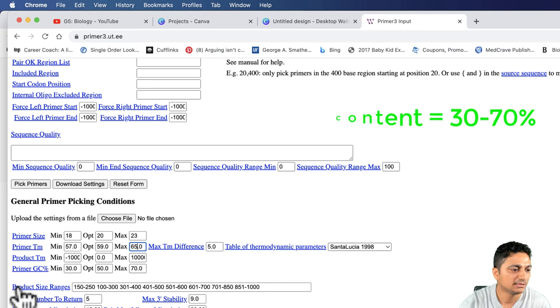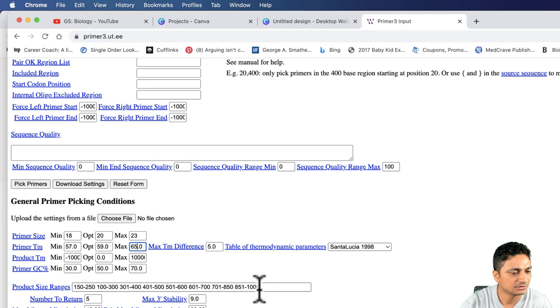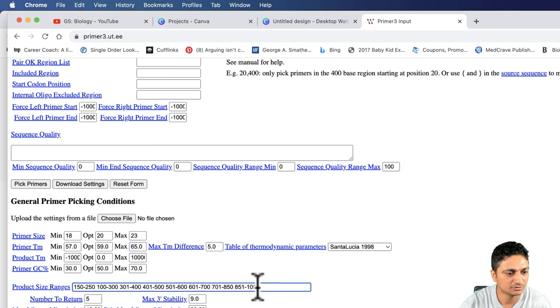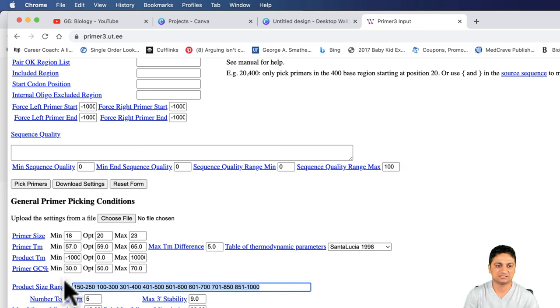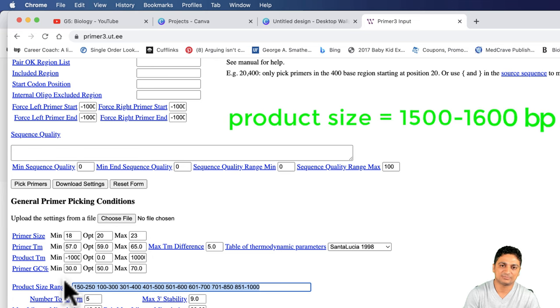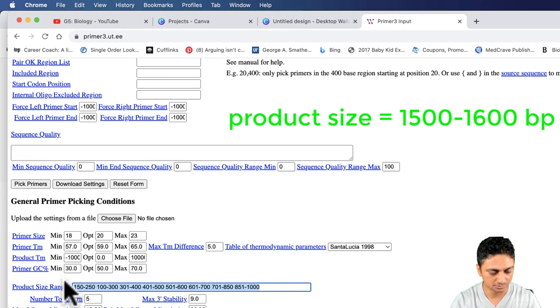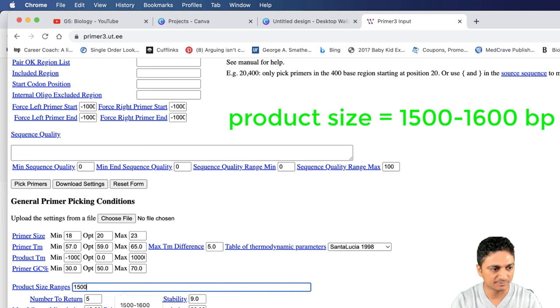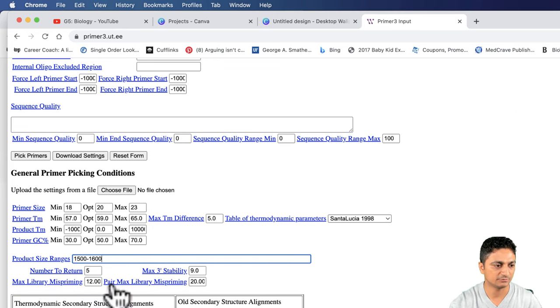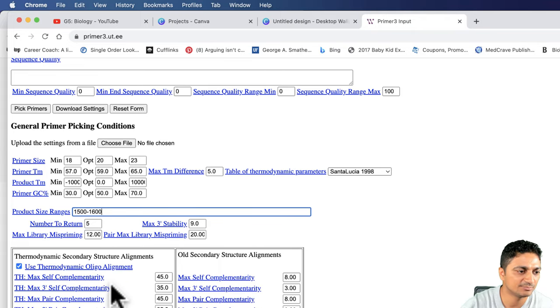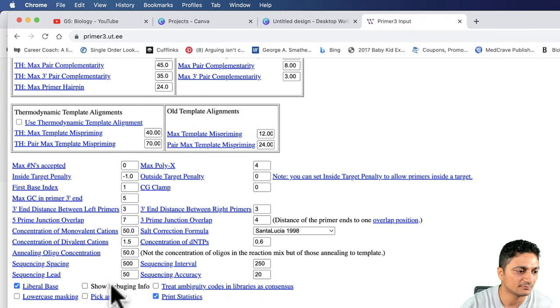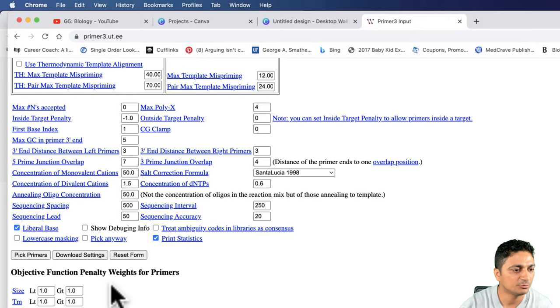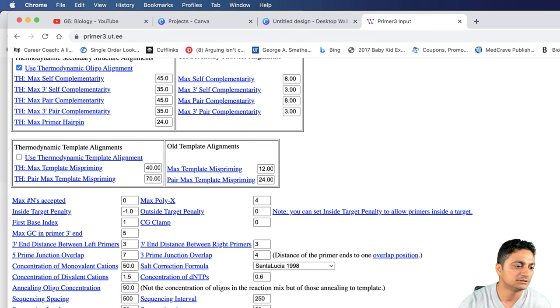The product size ranges is 150 to 850 to 1000. This is not going to work for us because we have to design the primer in the range of 1500 to 1600 base pair to clone the whole CDS sequence. I will type 1500 to 1600 base pair so that we can exactly get the primer in the UTR region. We don't have to worry about other details. Let's pick the primers.